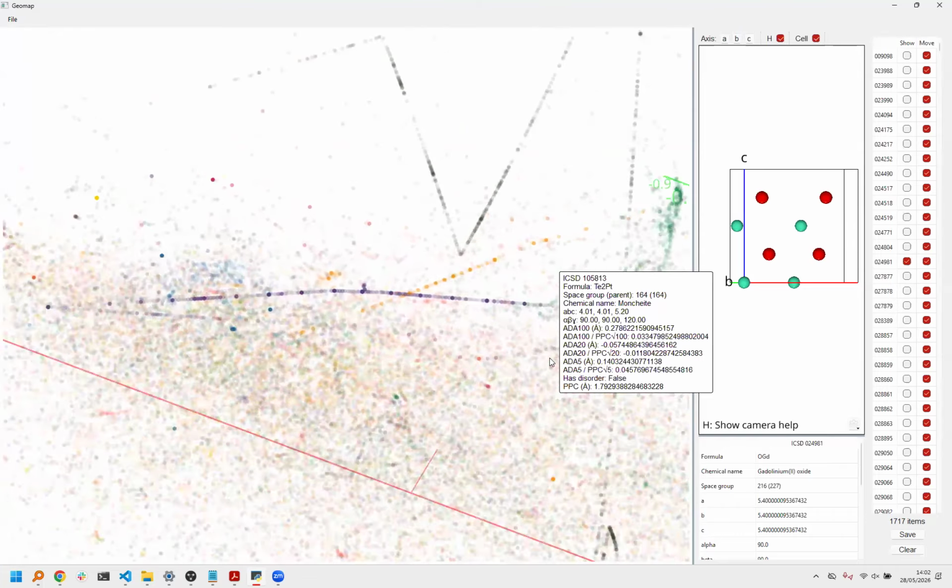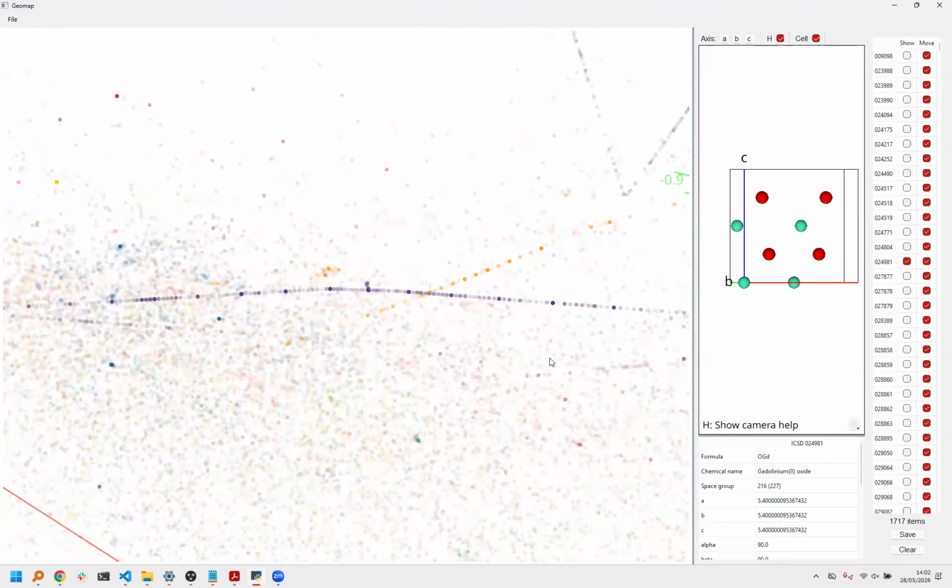Very unusual. The reason is precision, right? The values in CIFs are written to 2 decimal places, maybe 3, maybe 4. So you don't get a smooth, continuous movement here. It jumps in steps. So these very bold ones will be something like the ones that were written to 2 decimal places. The ones in between those are to 3 decimal places.